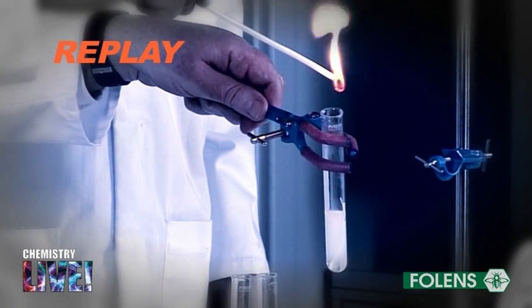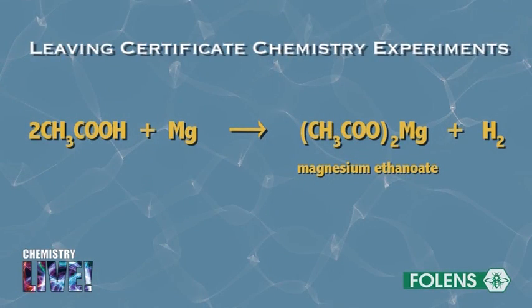This may be explained by the fact that ethanoic acid reacts with magnesium metal to form the salt magnesium ethanoate and hydrogen gas is liberated as shown on the screen. Hydrogen forms an explosive mixture with air and this causes the popping sound.